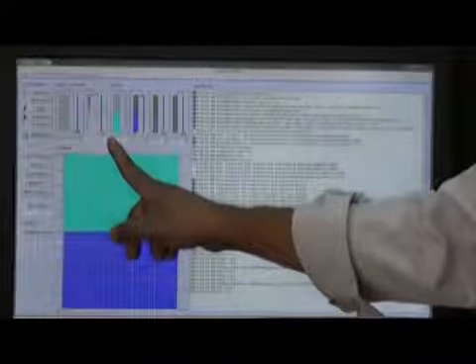Now I want, say, 50-50 (50A, 50B). I want to run this mobile phase, 50% A and 50% B. It can purge two lines, but I don't want to purge now. Purging is complete now. Now I want to run this mobile phase.